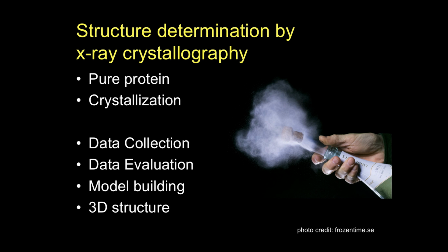Once we have crystals, then we can put them in the X-ray beam and collect data. Now, these steps of data collection, data evaluation, model building, refining the 3D structure, these are no longer rate-limiting steps. The real bottleneck is still the crystallization, for reasons I'll go into.